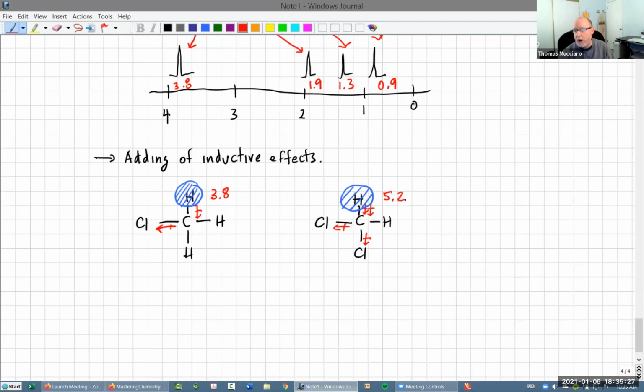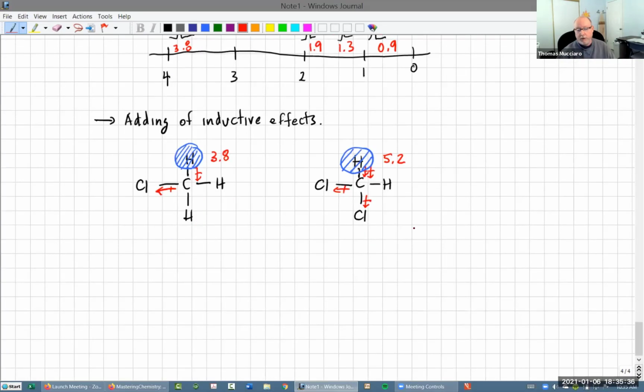This is the problem with NMR correlation tables that we don't have quite so much in the IR one. When you look at the NMR correlation table, it's going to be telling you the general, like if you have a thing pulling, it's approximately here. But a lot of tables, and in fact my basic table, doesn't have this.